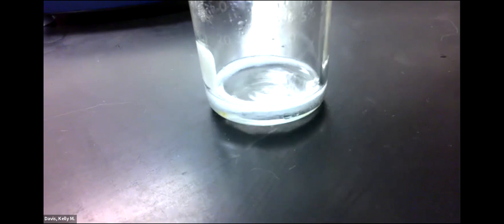Yep, it's definitely not all done because it's still bubbling. Let that go. See that magnesium sticks to the side there.